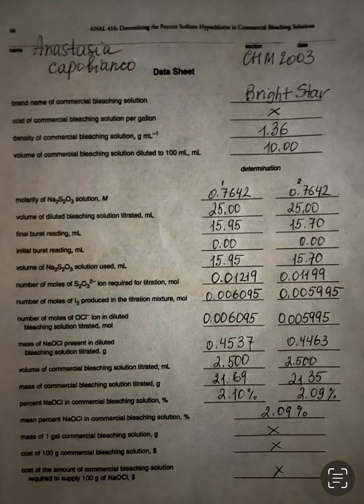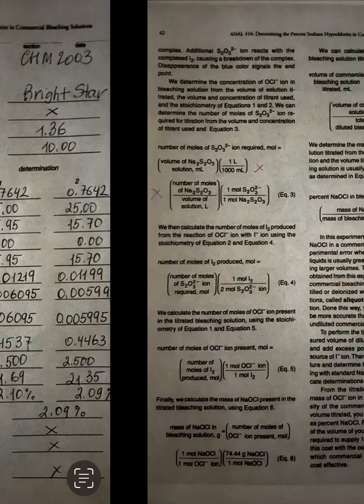Okay, let's move on. So how do I find the mass of sodium hypochlorite present in diluted bleaching solution titrated in grams? You have equation number 6 that will help you to find that. Mass of sodium hypochlorite in bleaching solution equals the number of moles of hypochlorite ion that you just found in equation 5, right?